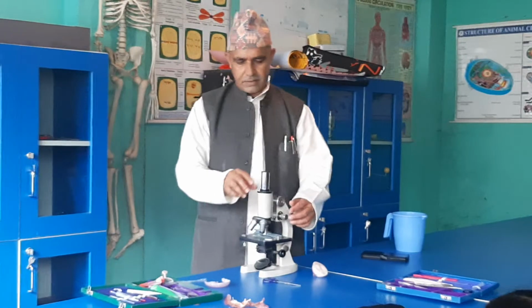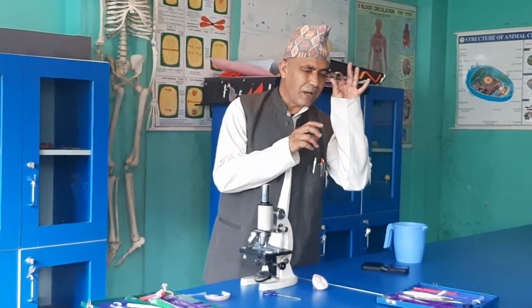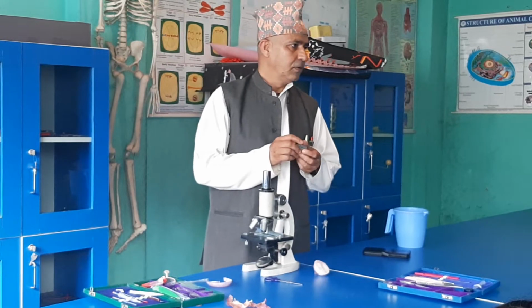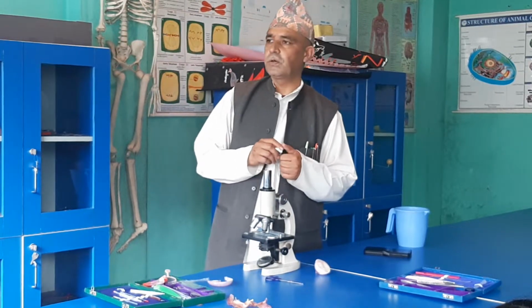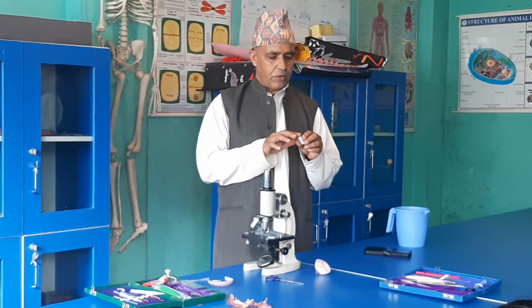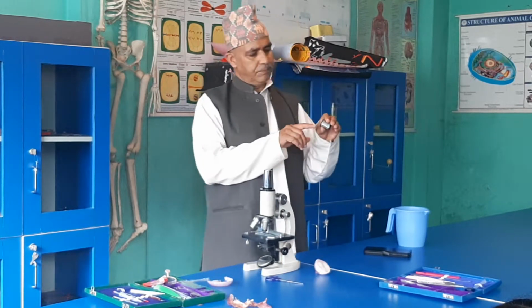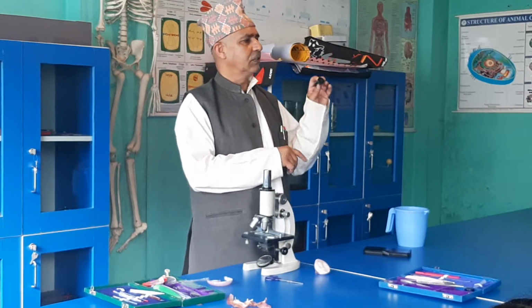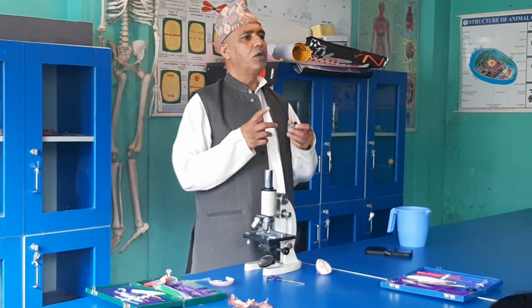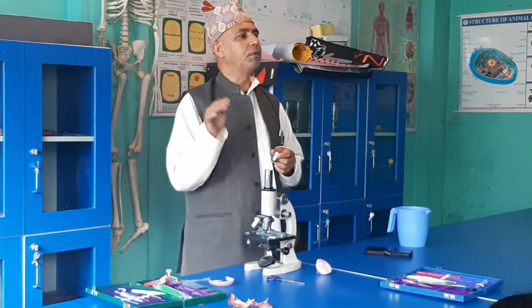Okay. And I already said its name is eyepiece, which is near to the eye. The one near to the object is called the objective. Telescope, microscope, they contain eyepiece as well as objective. According to their power, the multiplication is calculated. It is mentioned here 10x. 10x means it can multiply 10 times. Down also 10x. So altogether it will be 100 times. 10 tens are 100. It will not be added, it will be multiplied.